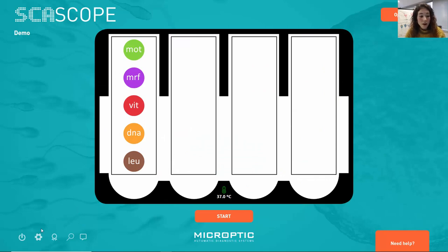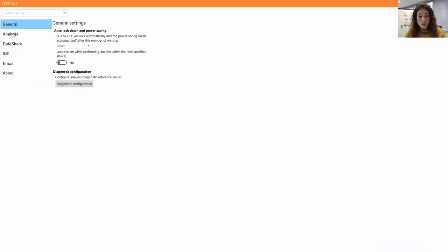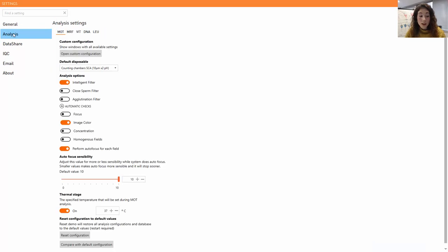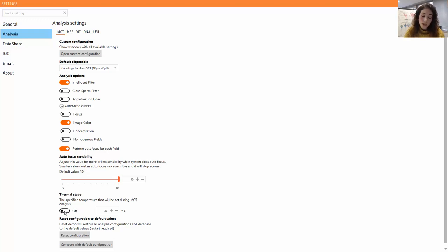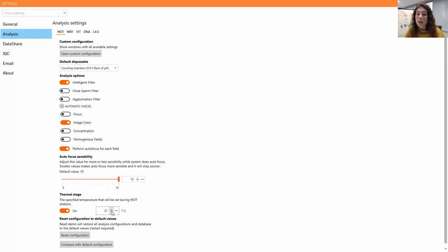Here we are in our SCA Scope. If we go to the settings, then the analysis settings, you can see that under the motility settings there is a thermal stage option. We can switch the stage on or off, or simply modify the temperature. Once the system is restarted, the change will be applied.